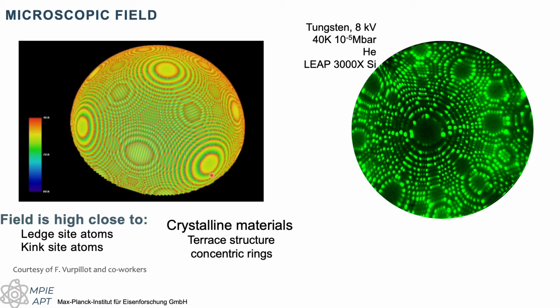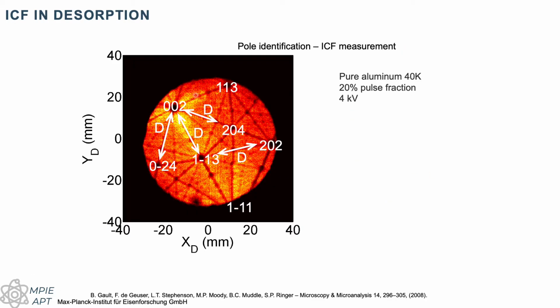Once again, we've seen this in the previous lectures. It is well reflected when we do field ion microscopy. But when we do atom probe, very often we end up with a figure of poles, and if we can identify these sets of poles corresponding to this set of planes, we can actually make use of this, because the distance between the poles is a reflection of how much compression there is.